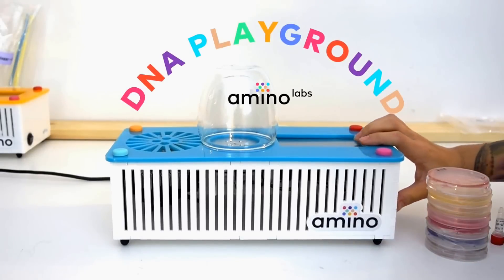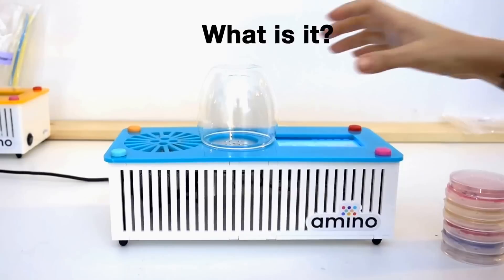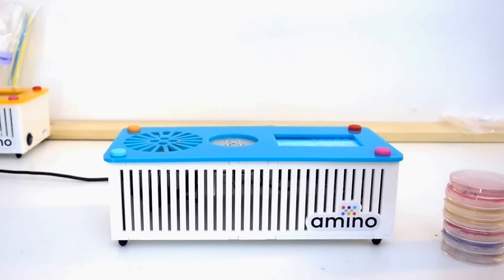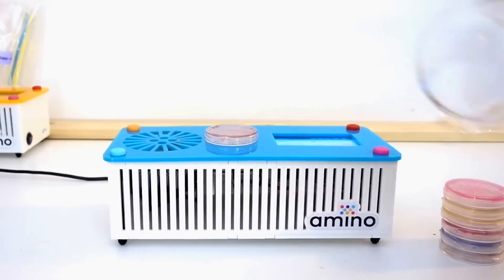This is the DNA Playground from Amino Labs. The DNA Playground is simple to use science equipment. It is made to save teachers and parents lots of time, but designed for students and young scientists to explore biology.